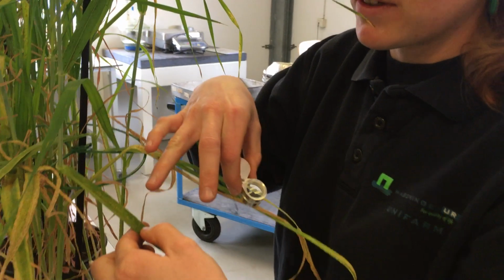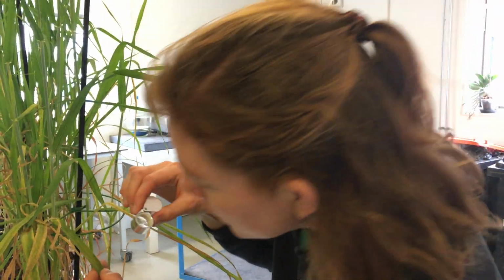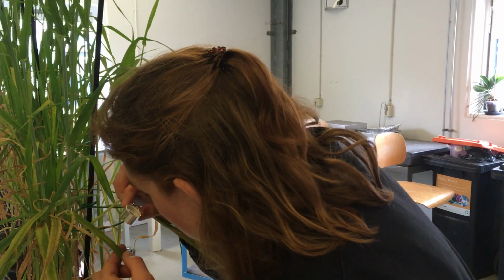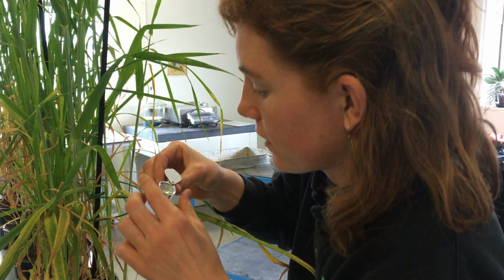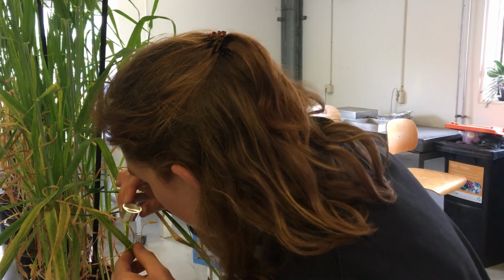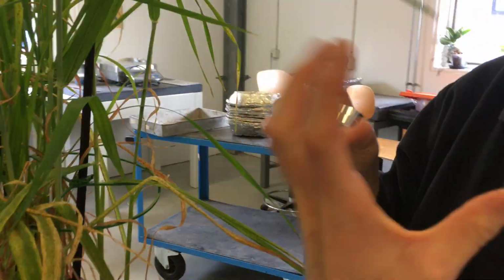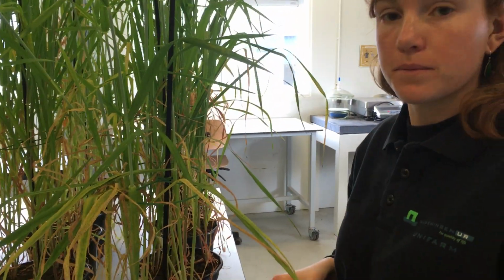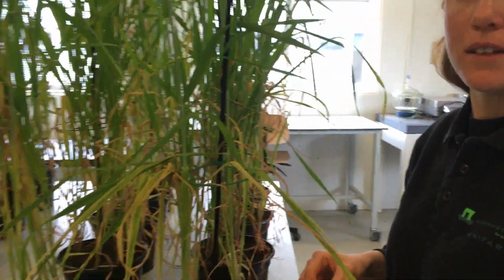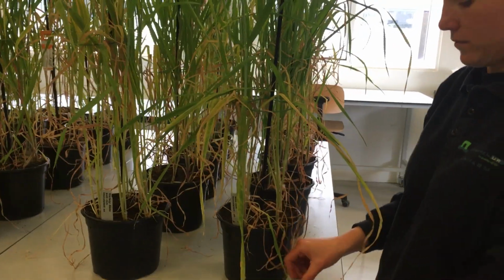So if I really want to get a closer look, sometimes for experiments you need to count the individual pustules. That's not necessary right now, but I would just look like this. Oh, it's upside down. And I could get a much closer look. Yeah, I can really see that they're springing out of the leaf. So that's the orange color. They are sitting on the leaves. That's right. Okay. And now we need to take the data.